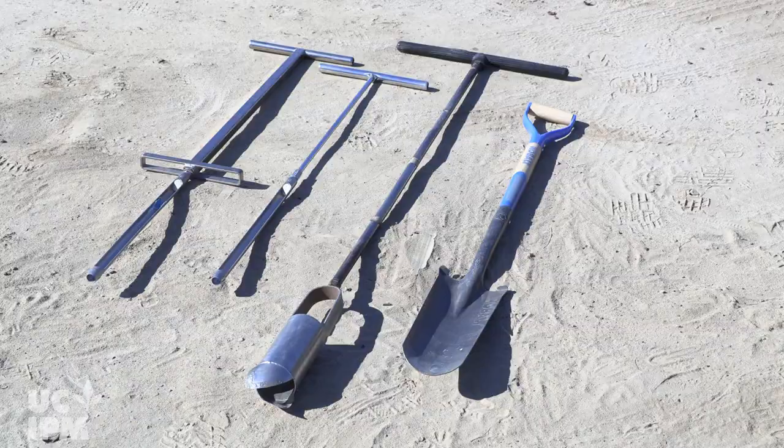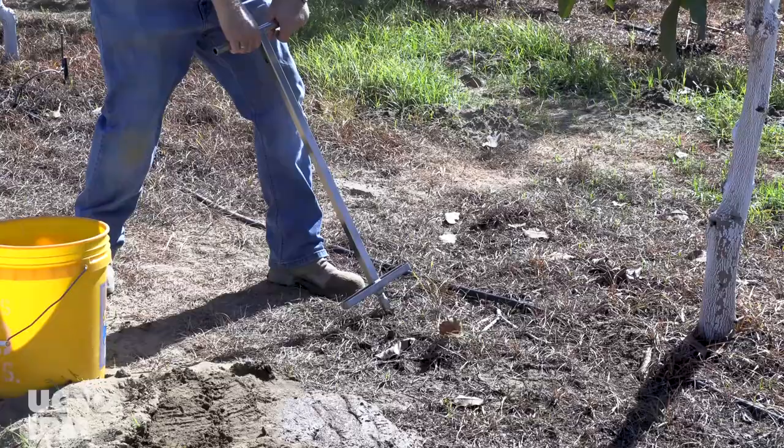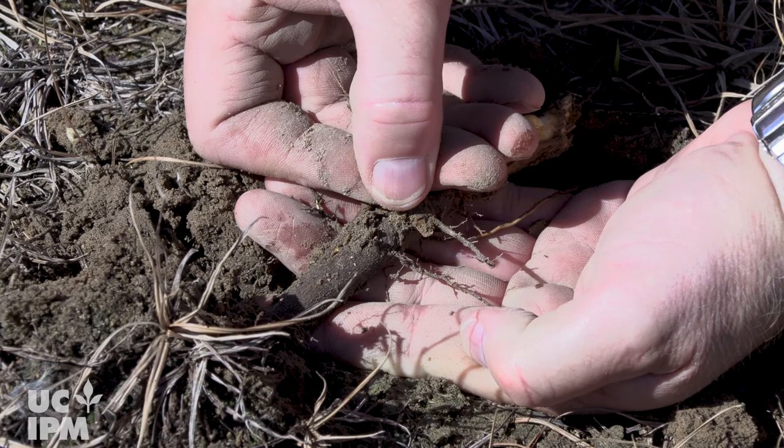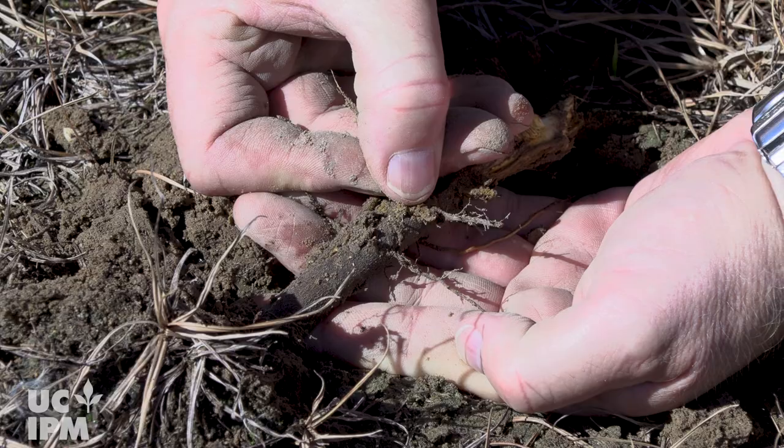Use a shovel, auger, or soil probe. Push the probe into the soil so the entire tube is in the soil, then twist and pull the probe out of the ground. Scrape the soil into a bucket using a screwdriver or a similar tool if needed to dislodge the soil. In existing orchards, make sure to include some roots in the subsample so that lesion and other root-dwelling nematodes can be detected.